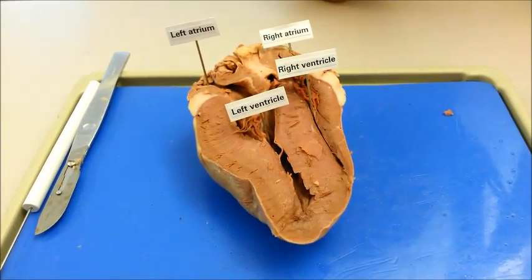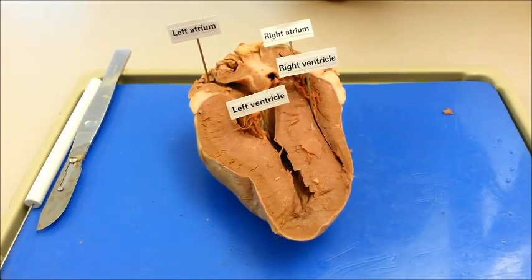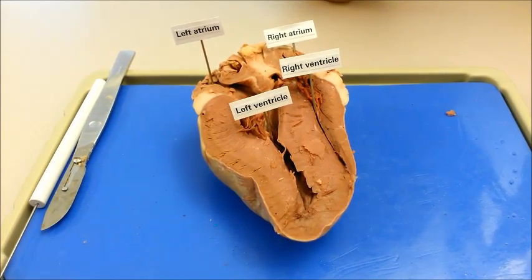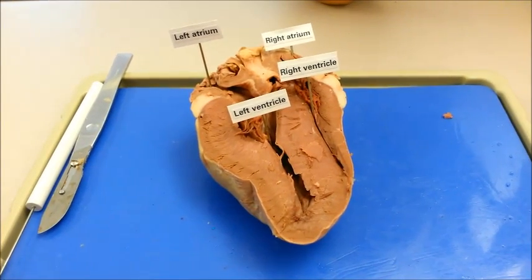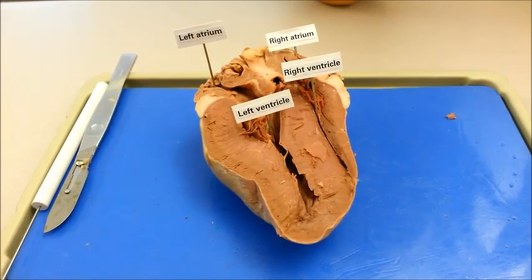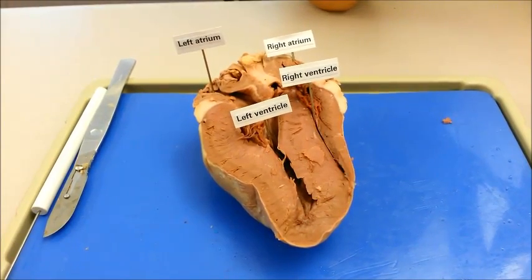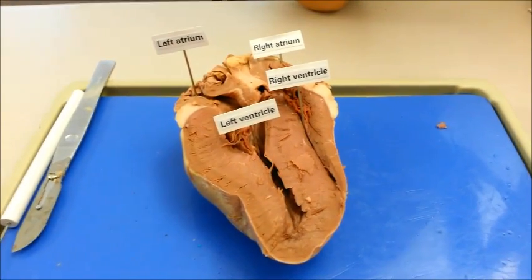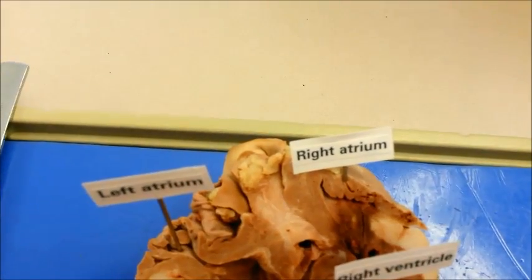Blood flows from the right atrium through the tricuspid valve into the right ventricle. Then it is pumped through the pulmonary valve and into the pulmonary artery, which then goes into the lungs. From the lungs, blood flows through the pulmonary veins into the left atrium. It goes through the bicuspid valve and moves into the left ventricle. Then it goes through the aortic valve and into the aorta, which will redistribute the blood to the rest of the body.